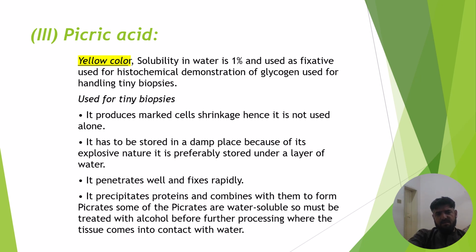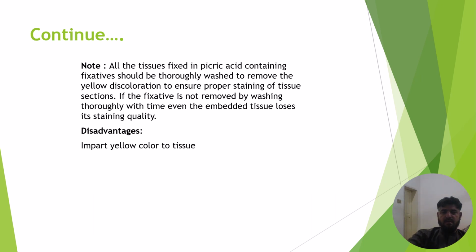It precipitates proteins and combines with them to form picrates. Some of the picrates are water soluble, so the tissue must be treated with alcohol before further processing, where the tissue comes in contact with water. Picric acid also imparts a yellow color to the tissue.